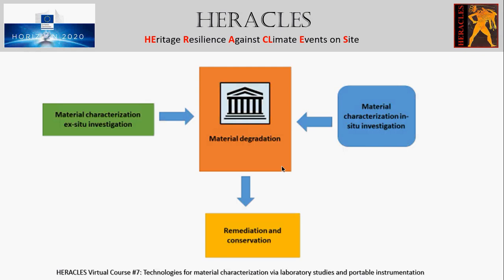So the ex situ analysis will be focused on the identification of materials and determination of their alteration and deformation mechanisms by using high resolution sophisticated measurements. For many cultural heritage materials, the characterization begins with macroscopic observations and measurements by the in situ investigation.